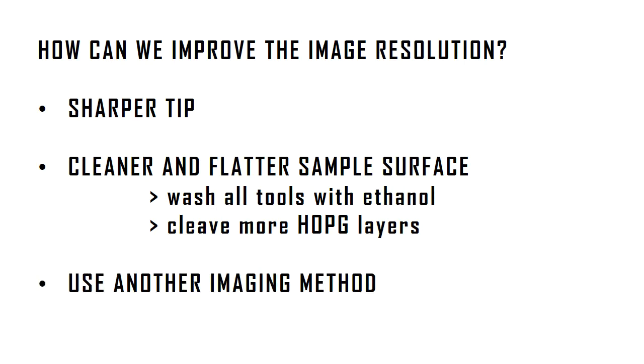The last suggestion would be using another imaging method known as atomic force microscopy. AFM is also an imaging method widely used in nanotechnology because it has a tip which touches the surface atoms, resulting in an image of higher resolution compared to STM.